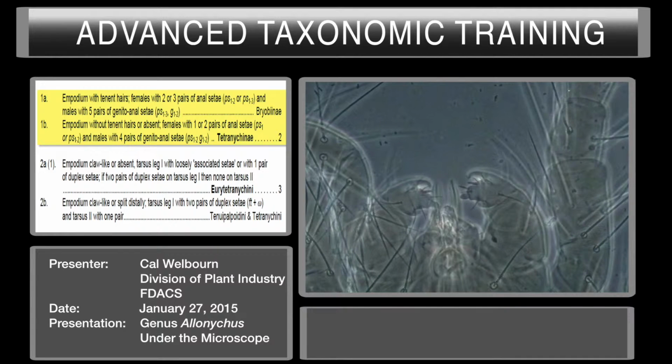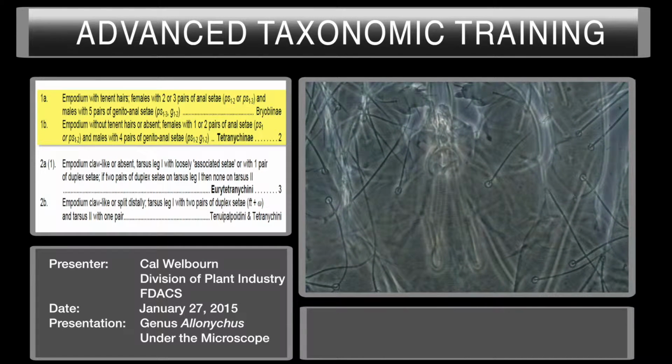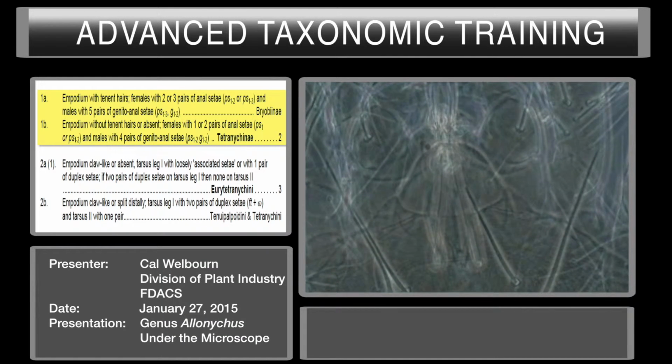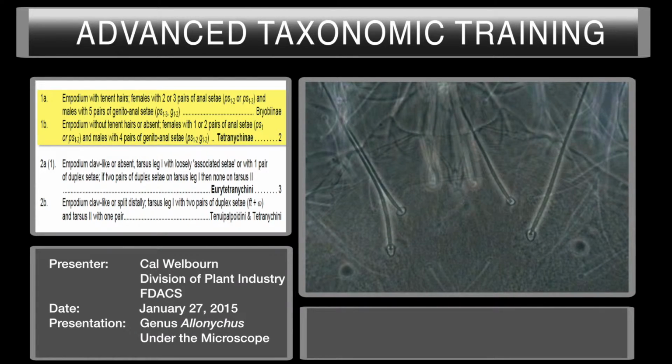So characteristics of Tetranychidae include thumb claw, long stylet-like chelicerae with a proximal hook, peritremes that are on the anterior portion of the mite, stigmata between the chelicerae bases. In this case, the chelicerae bases are fused into a stylophore, and there are 3 or 4 pairs of prodorsal setae, none of which are trichobothria, and they're your eyes. There's usually 2, but one shows up more prominently than the other. You already know this mite is a Tetranychidae. Now we're going to follow it through the key to get to the genus Allonychus.